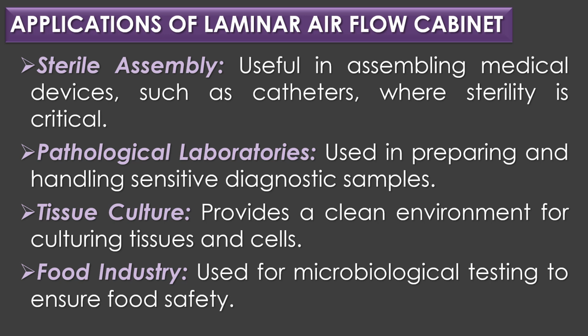In tissue culture, laminar airflow cabinet provides a clean environment for culturing tissues and cells. In food industry, laminar airflow cabinet is used for microbiological testing to ensure food safety.